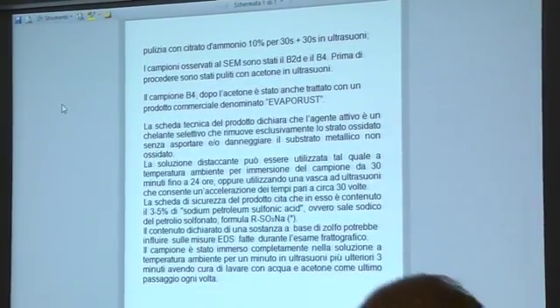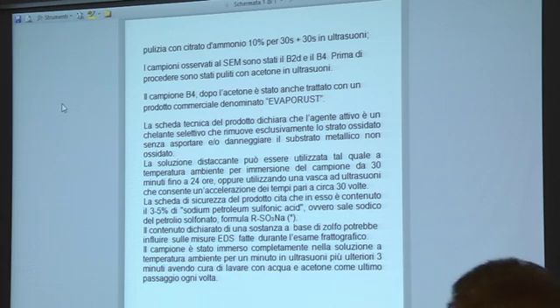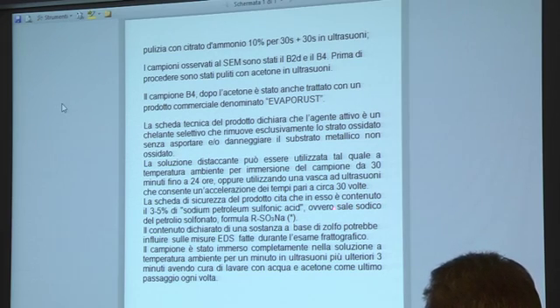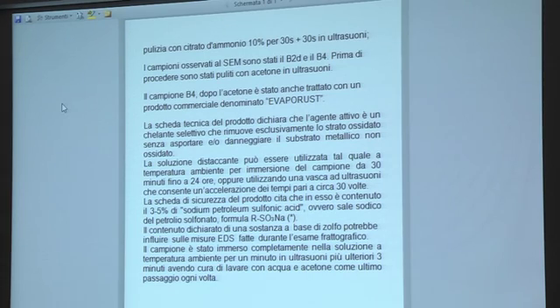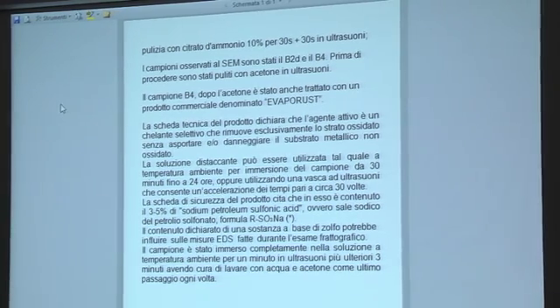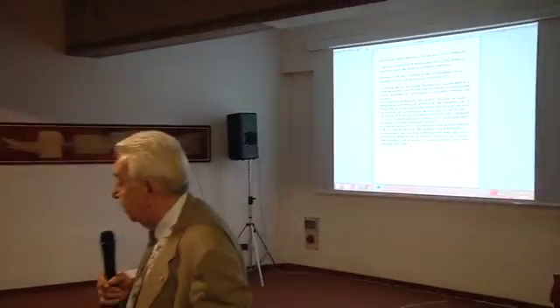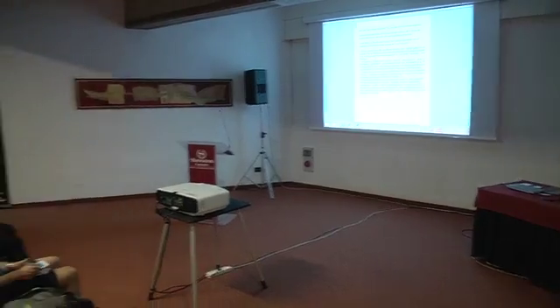But we have been using lately a liquid that we bought in the States that is named Evaporust, and this is a sodic salt of sulfonate, petroleum sulfonate, that really cleans the surface, leaving the substrate unetched. So if you are in a problem, this is the best way. I'm not paid by this company, but this is what I have been using lately and solving many of my problems. Thank you. Bye-bye.